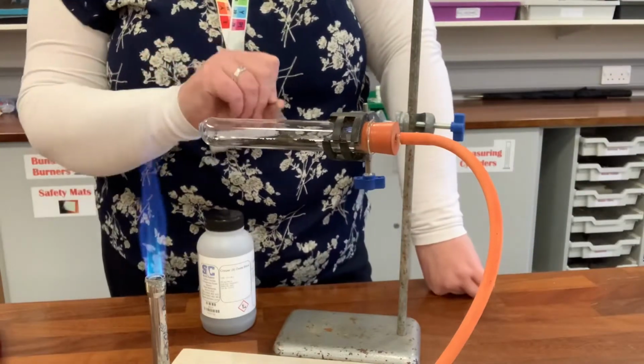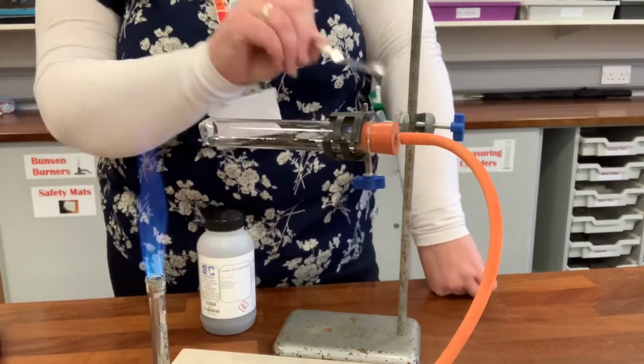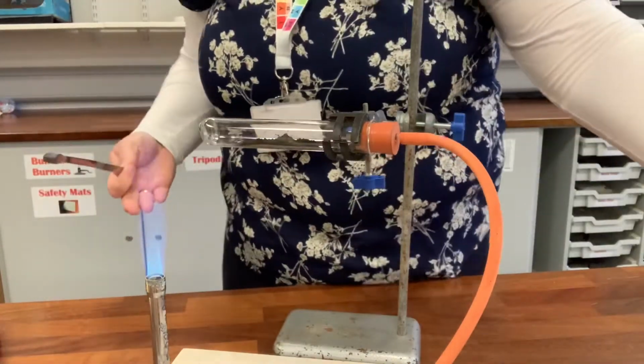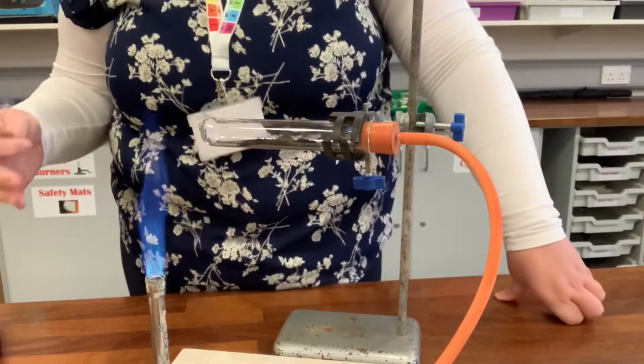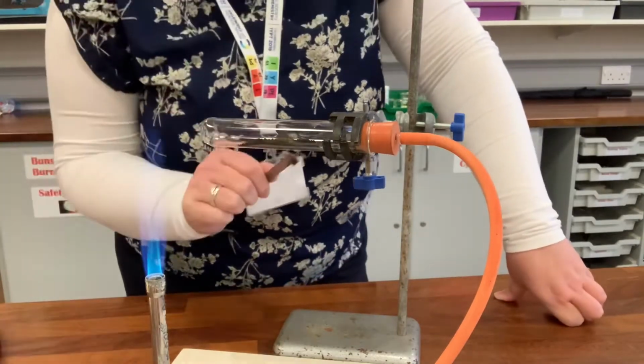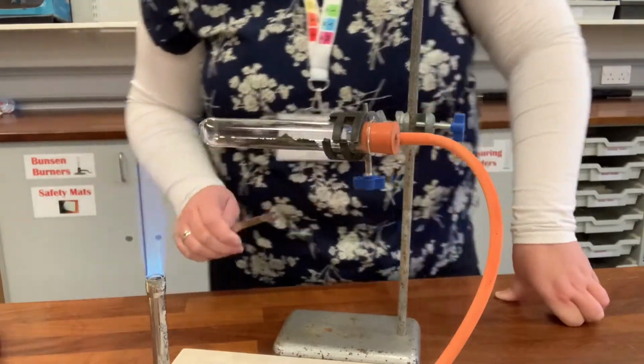And what we're going to do is heat the copper oxide in a stream of gas, and it's going to reduce. So it's going to take the oxygen away from it. So it's going to be copper oxide. We remove the oxygen from copper oxide and we should be left with copper. So we should be able to see a copper colour in the tube at the end.